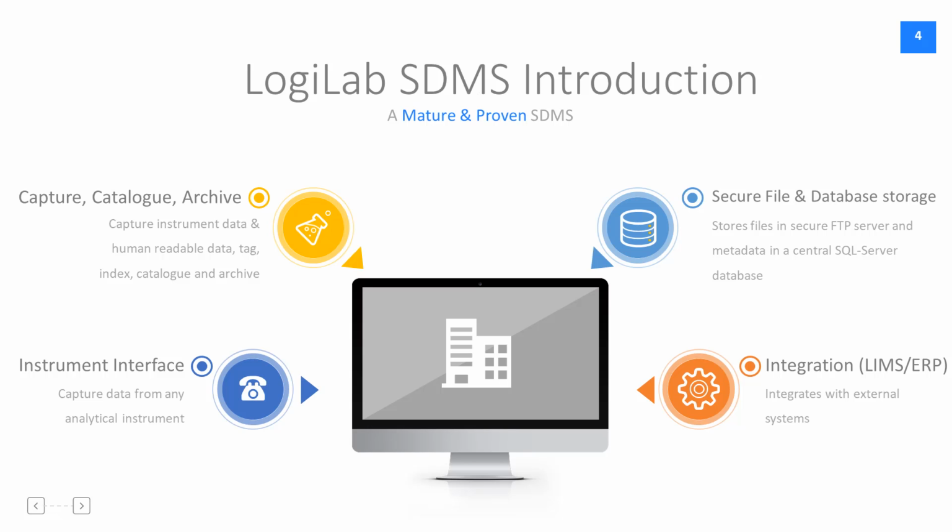LogiLab SDMS has been designed for integrating external systems like LIMS, ERP systems, or an electronic lab notebook system. There are appropriate middleware tools available for integrating external systems through the LogiLab SDMS system.